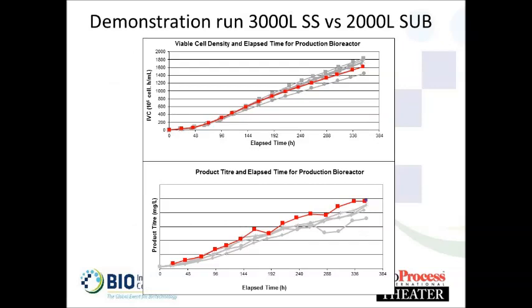Copenhagen did this comparison run for us, where the 3,000 liter stainless steel reactor was our data, and then the 2,000 liter single-use bioreactor was what they did. And you can see here that for the viable cell density, it overlays almost exactly. And for the titer, it overlays as well. You could actually even argue here that maybe we got a little bit better titer than the stainless steel reactors.